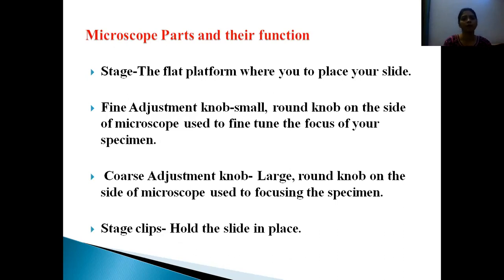The stage is the platform where you place your slide. The fine adjustment knob is a small knob on the side of the microscope used to fine-tune the focus of the specimen. The coarse adjustment knob is a large round knob on the side of the microscope used for focusing the specimen. The stage clip holds the slide in place.